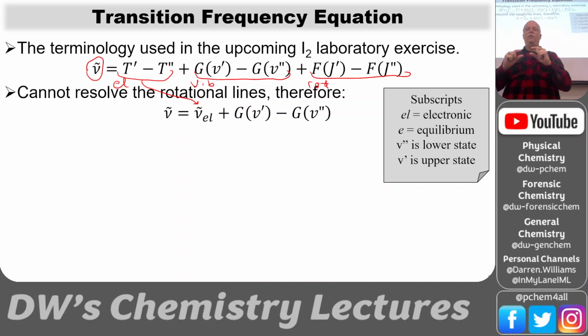And so we would be able to detect that the more energy levels we test. Okay, if we only have down in the ground state 0 to 1 and 1 to 2, we're not going to be able to detect the anharmonicity in the ground electronic state very well because we only have 3 levels to measure. But in the excited state, we go from like 15 to 26 or something like that. So we have lots and lots of information about the excited state because we're doing absorption.